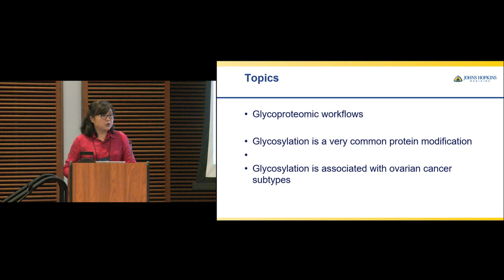One is the glycoproteomics workflow. Glycosylation is, I would say, if not the most common, a very common protein modification. And glycosylation is associated with ovarian cancer subtype. Due to the time limit, I actually took out 20 slides right before this talk to get us to dinner on time.